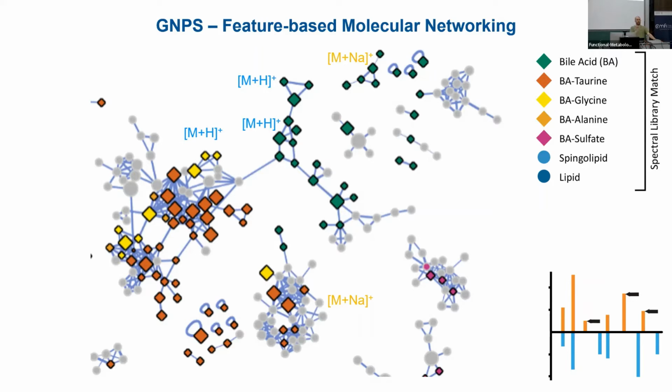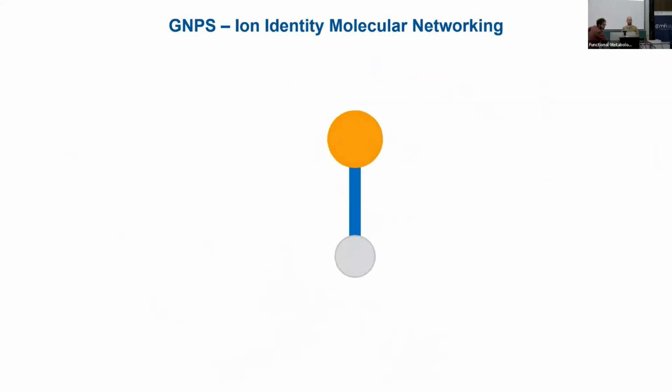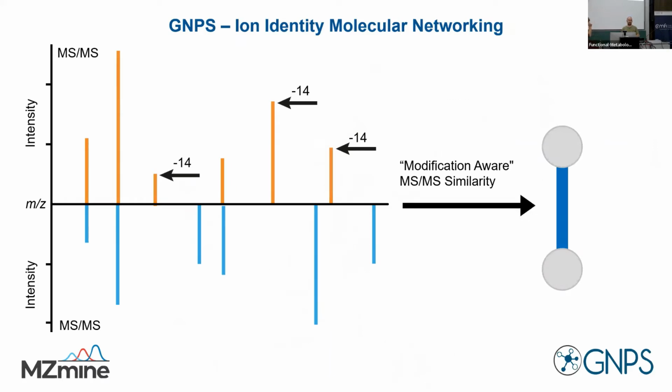It's important not to mix up MS1 and MS2 there, right? In MS2, we isolate only one ion at a time and then fragment it. So if there is already a pattern that would be natural from your metabolome, then that would be all individual peaks. Obviously, those should have similar fragmentation patterns. So we would hope that biotransformation products will be connected in the network. And I think that's exactly one of the strengths, right? That we pull related metabolites together and cluster them in molecular families. So the promise is already that we look at two different things.